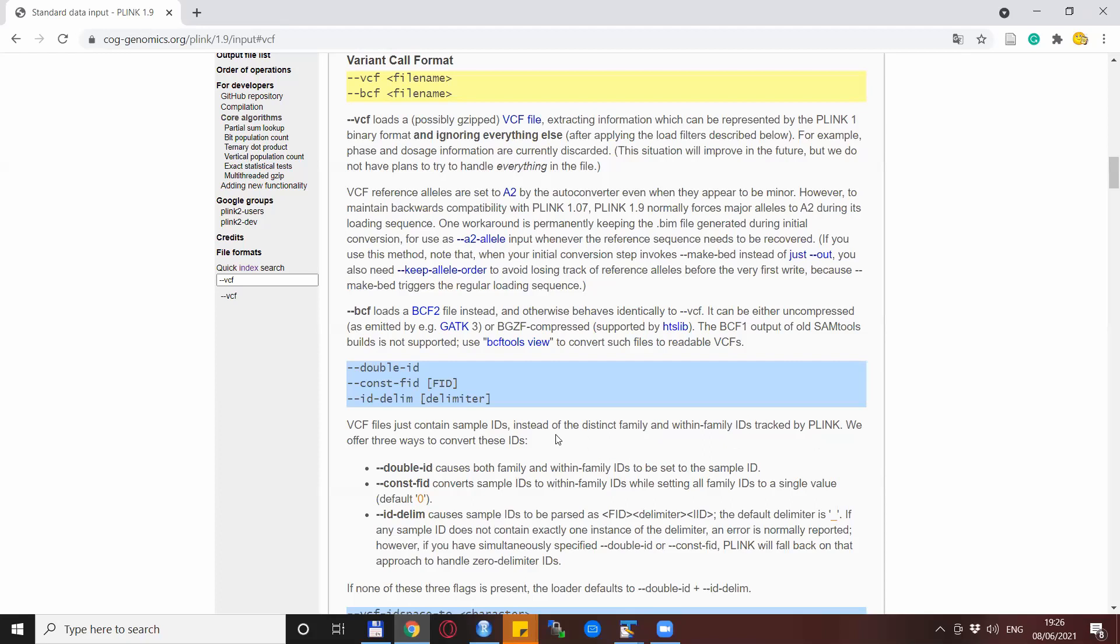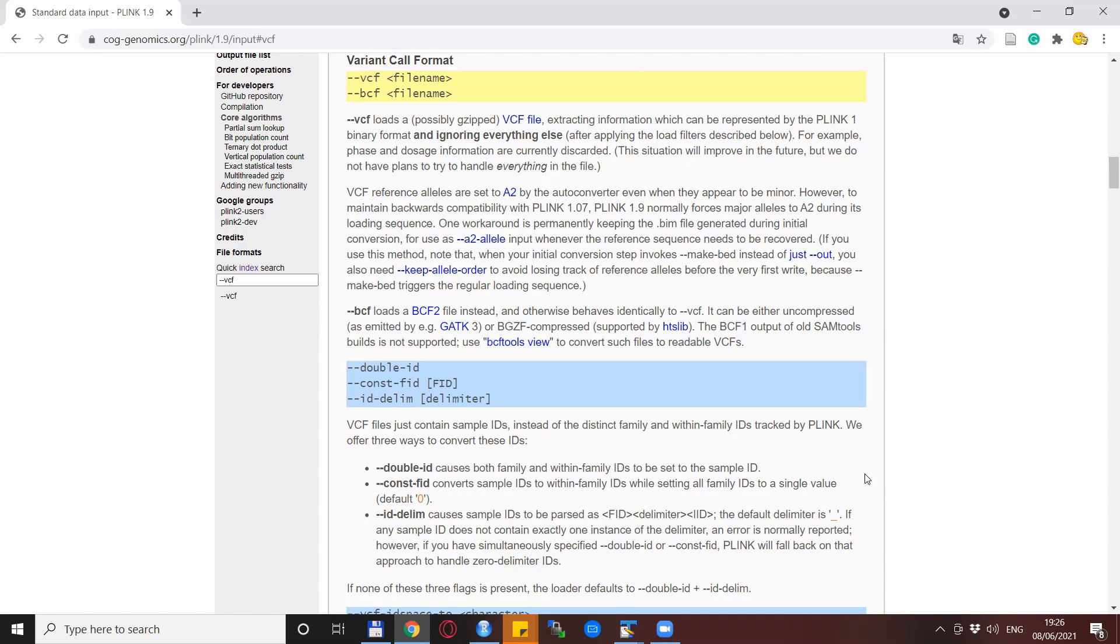But Plink already gives us very helpful suggestions how to solve this problem. The core of the problem is explained on the Plink website and it says that the VCF file just contains sample IDs instead of distinct family and within-family IDs. The delimiter between the FIDs and the IIDs happens to be the underscore. So if you have an underscore also in your normal ID, then you end up with more than one underscore in the ID for the VCF file. So Plink when tries to transform it back doesn't know which underscore to use to divide the FID from the IID when creating ped files.